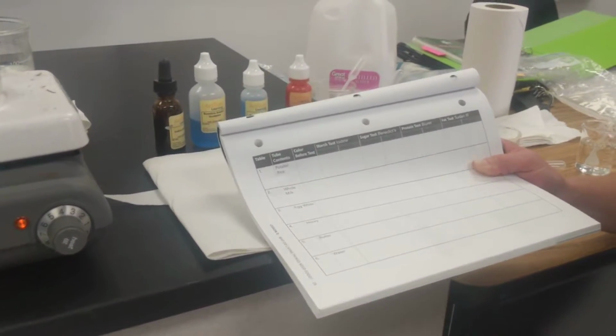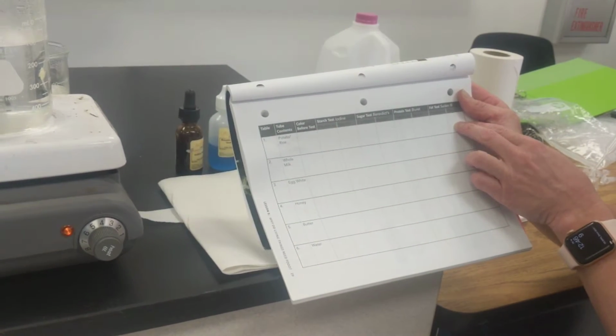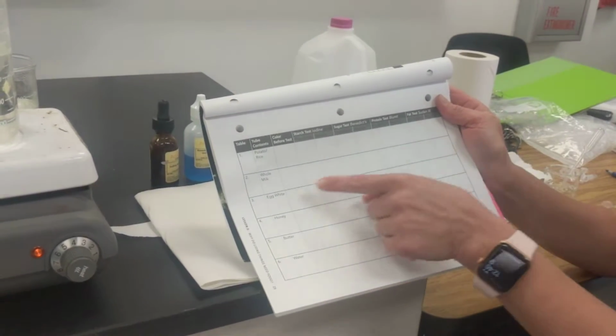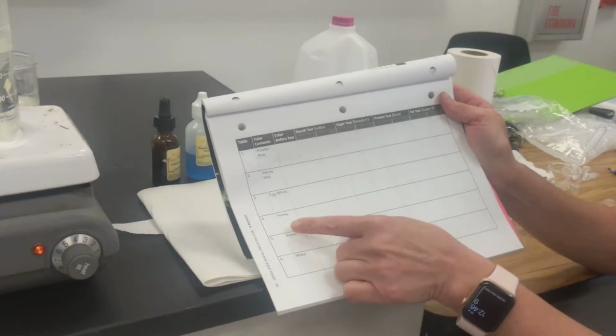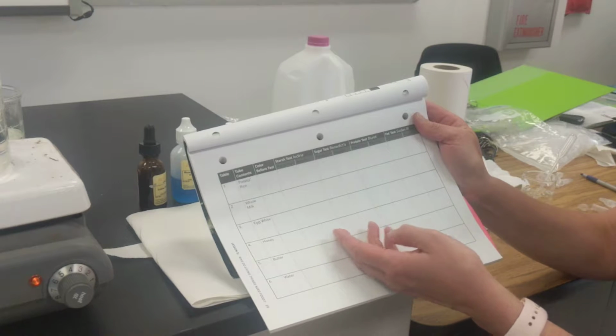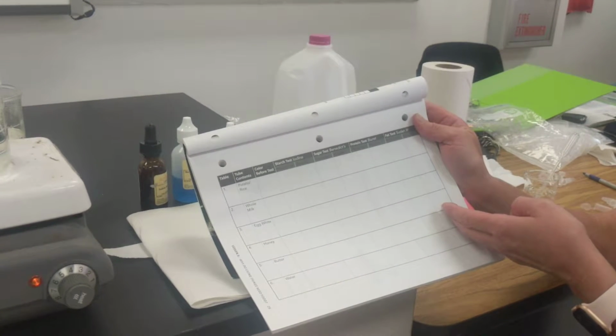All right, so here is our data table. Just to kind of get us caught up, we should be all set with row 1, the rice. We should be all set with the whole milk and the egg whites. The honey, I'm going to ask you to do something a little bit different with the honey. I first want you to make predictions. Do you think there's starch? Do you think there's sugar? Do you think there's protein? And do you think there's fat?